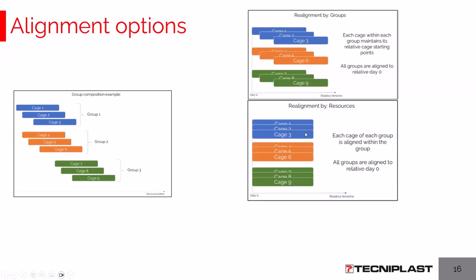This is on one side very powerful because, especially for longitudinal studies where cages belonging to the same group have been created in different periods in time, you can really realign the group and consider the group as a whole. But you have to take care that the day 0 of the realignment is the date you set.